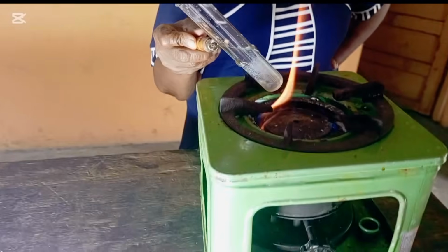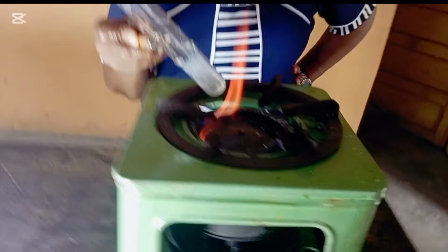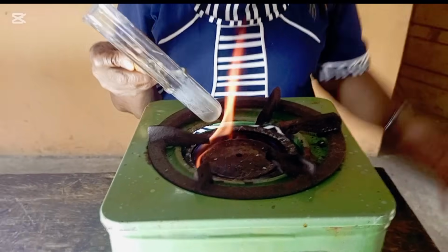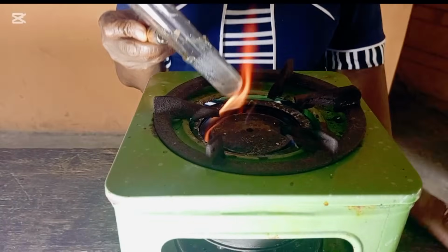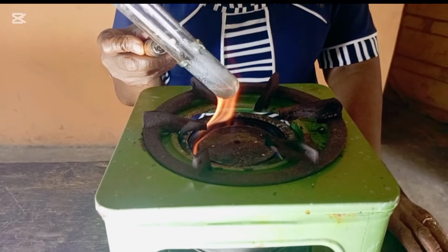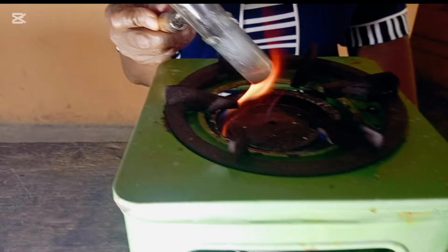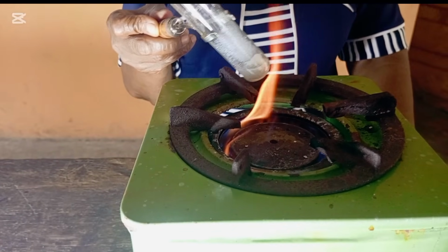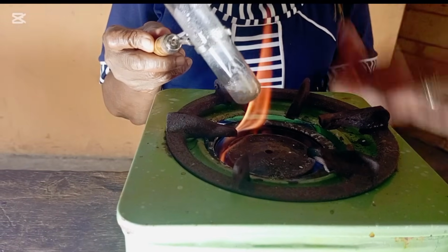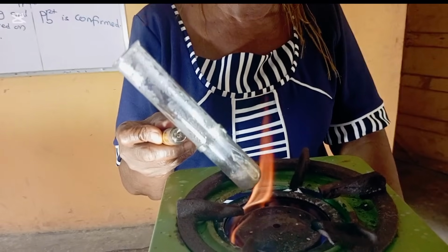Just have it in mind that I am carrying out all the necessary tests, or some of them can be asked, just to be on the safe side. Try to observe everything. So whichever one that is asked, you've seen it, you observe it, you can now report very well. You can see that it is condensing at the upper part of the test tube.